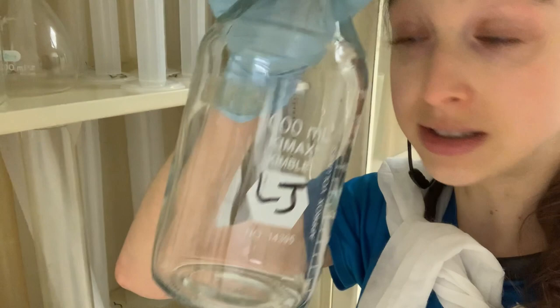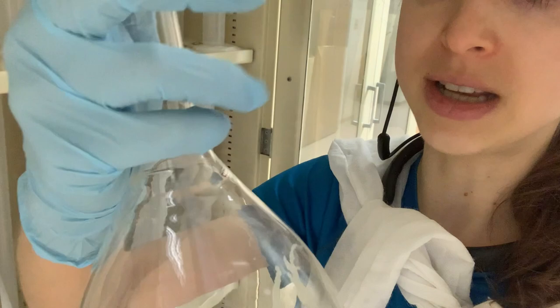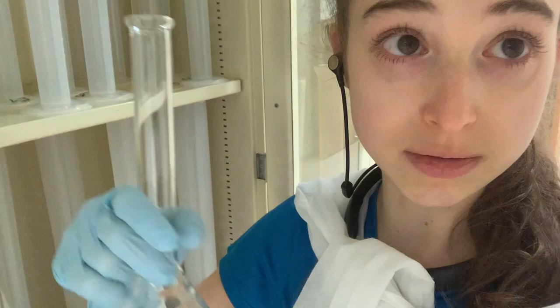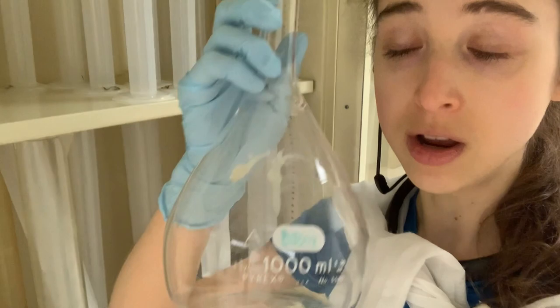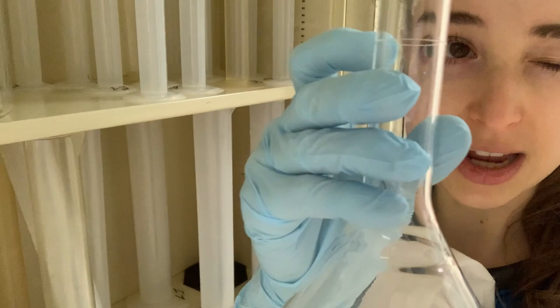If you want super precise measurement, there are volumetric flasks — used more in chemistry. Unlike graduated cylinders with many lines, volumetric flasks come in a single volume with just one line. They have a big flask part and a narrower stem, and that line is calibrated to be very precise — plus or minus 0.3 mL. When measuring, you measure from the meniscus. Water will curl up the sides because it sticks to the surface; you want the bottom of the meniscus to sit on the line.